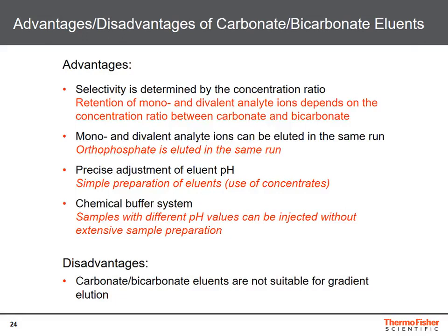And this is very advantageous because in most of the cases my sample pH differs from the eluent pH. If I have a chemical buffer system, I can inject these kind of samples without extensive sample preparation.